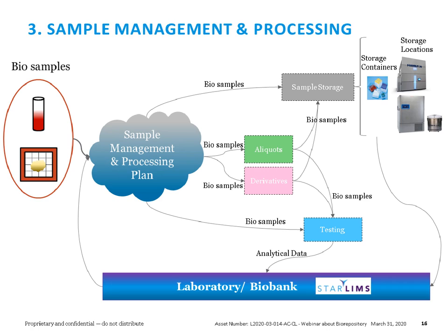So there could be different conditions and situations that the LIMS solution is going to have to account for in order to say what is the next thing to do for these samples that we just received, they are, let's say, in the benchtop, and now we have to determine what to do next, and we have to provide hints to the users in the lab to let them know these are the samples that perhaps they need to go to storage. So that could be one option.